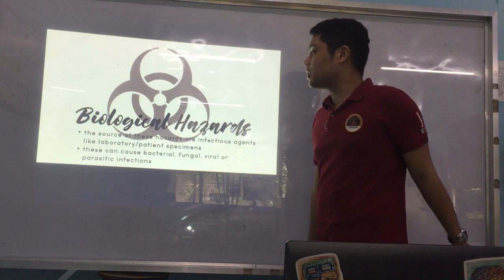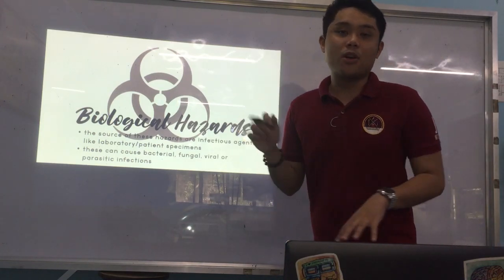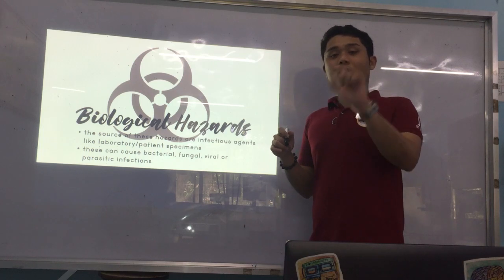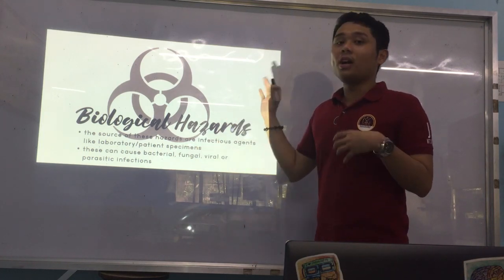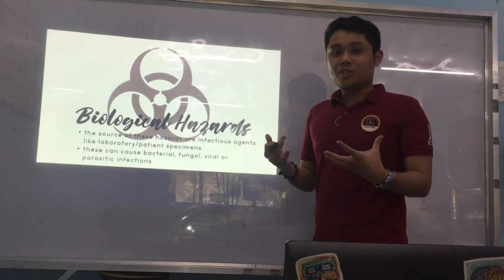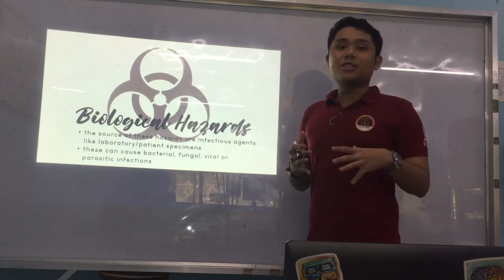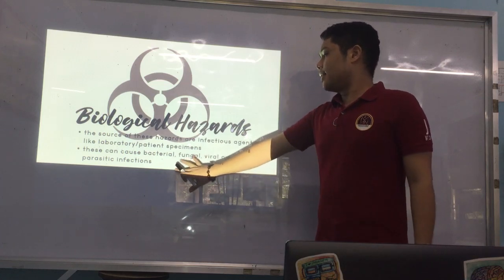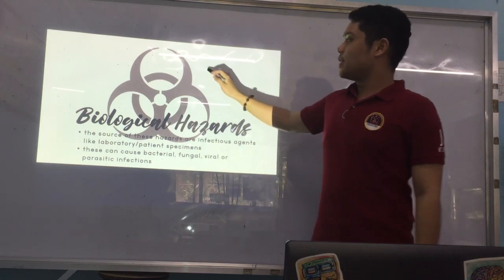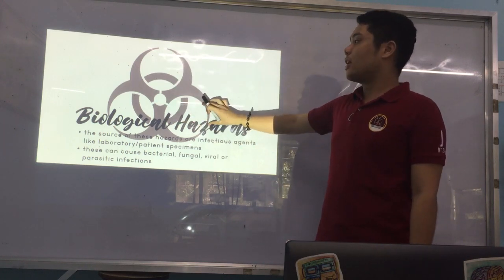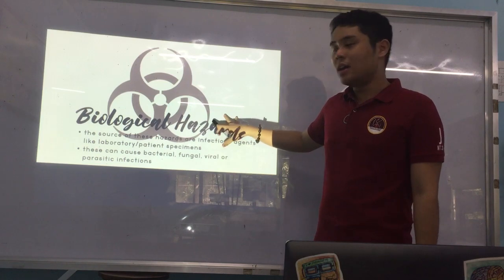Our first hazard is biological hazards. When we say biological hazards, the source of these hazards are infectious agents themselves — it could be bacteria, viruses, parasites, or even fungi — and these can cause bacterial, fungal, viral, or parasitic infections. Please take note of the biological hazard symbol, or biohazard symbol. It is described as three circles with an overlapping one circle at the center.